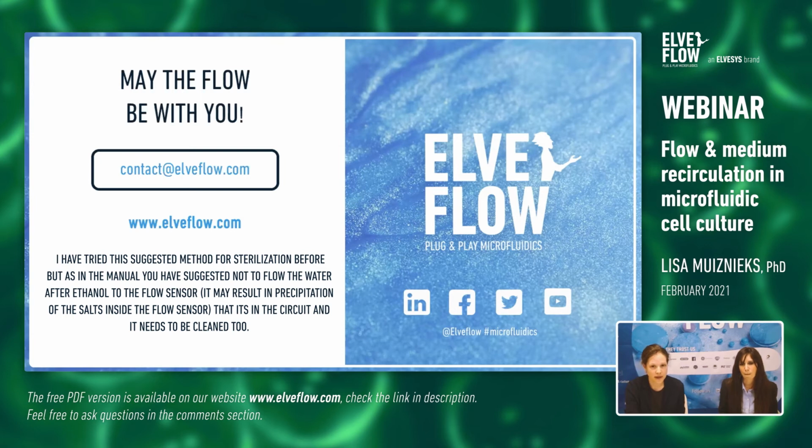Let's see if I get the question right. Don't flow the water after ethanol. The point is not just washing with water, if I understand correctly, but this can create some drops that can eventually leave some residues in the inner capillary of the sensor. So it's always better to flush with ethanol after and air dry, if we understand correctly.